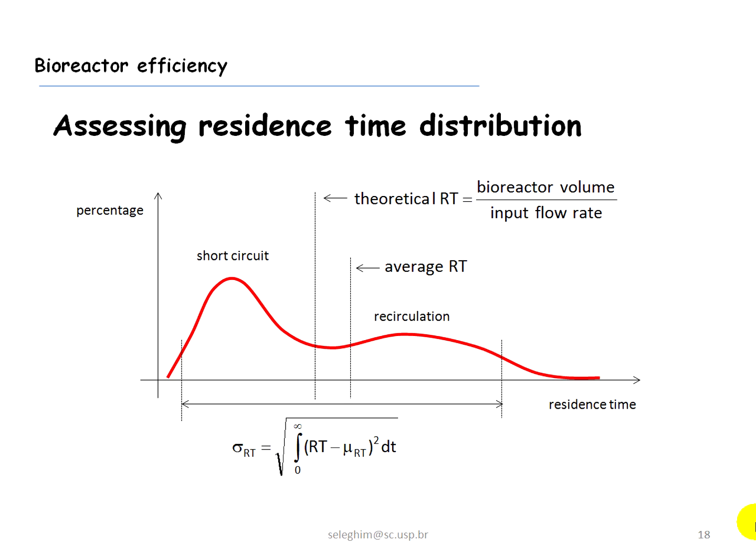Those are particles that take a streamline that goes straight to the output, so the particles here spend less time than the necessary time for the biochemical reaction to take place, okay? And you also have this region here in which the corresponding particles stay longer than the necessary time. Okay, so this effect and this effect actually contribute to the deterioration of the performance of the device.